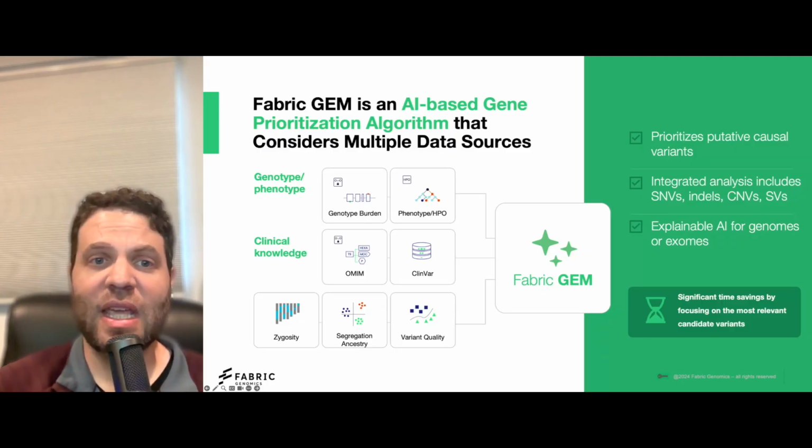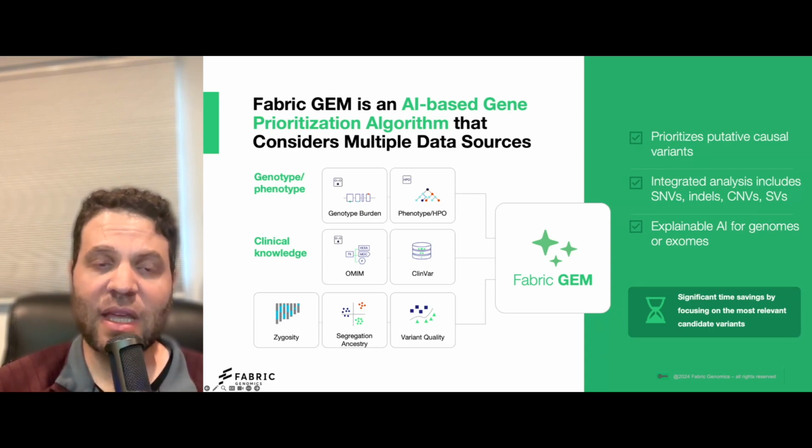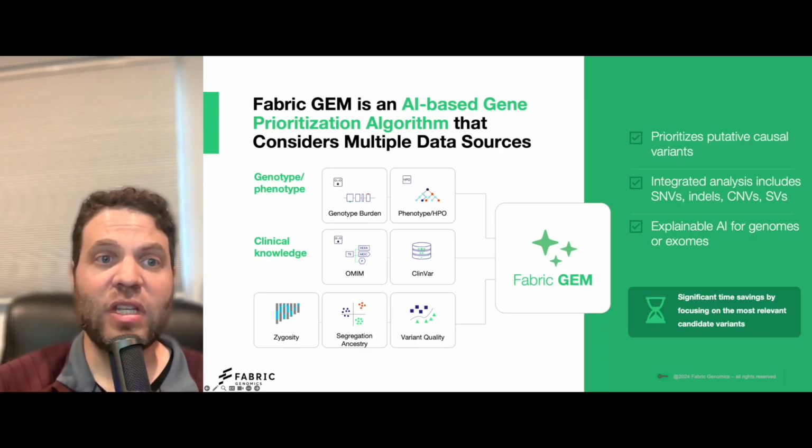And it also has an error model built in for the different platforms that we support. So for Oxford Nanopore Technologies, we were able to get a large data set of samples and train the model on the patterns of variants that occur in normal genomes and also the variants that are disease associated. So we're able to prioritize those genes that have genotypes, including recessive genes that have 2 variants in them. I'll show an example of that later. With phasing, we're really able to get down to a short list of candidates per genome that need to be reviewed to get high sensitivity.